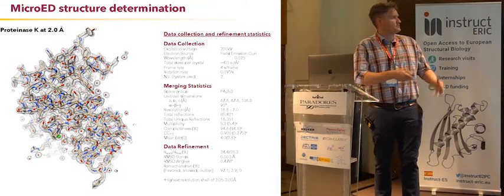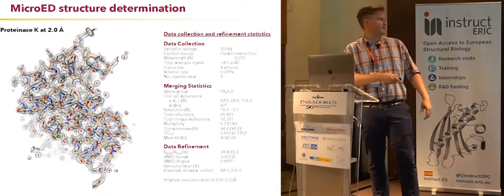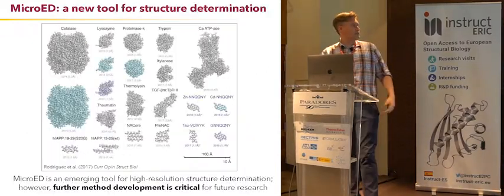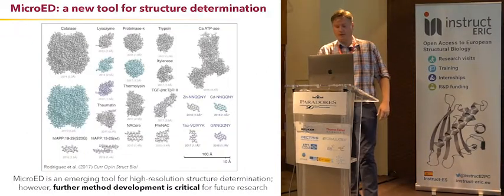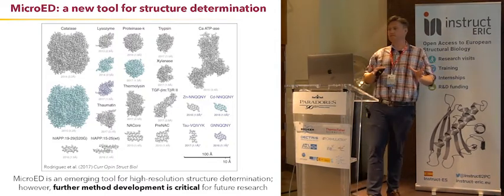There are a few things which we can talk about in the questions, or talk about later. Sometimes the R-frees and such are a little high. There are reasons for that, but other than that, it works pretty well. So that's the quick run through of how MicroED works.